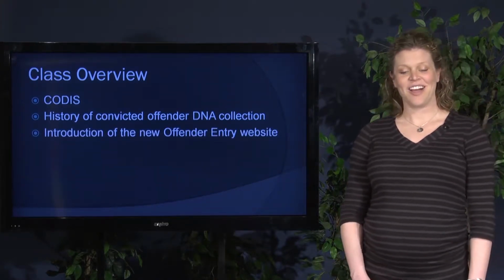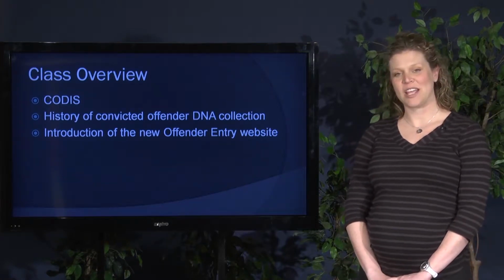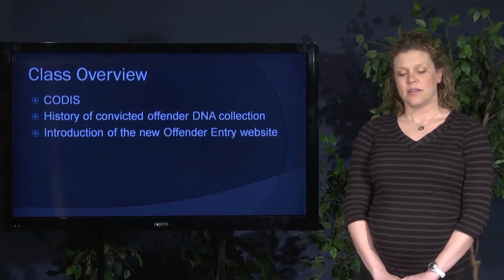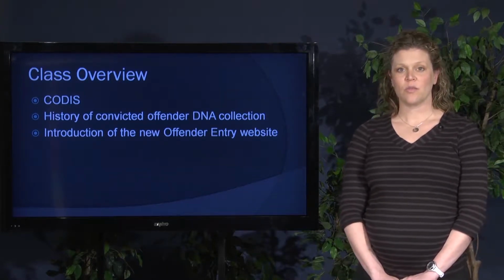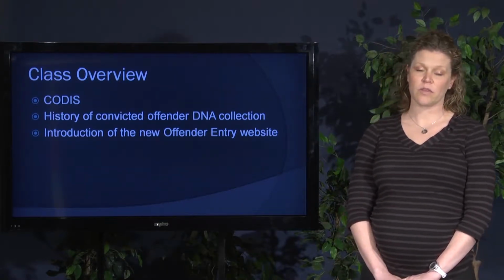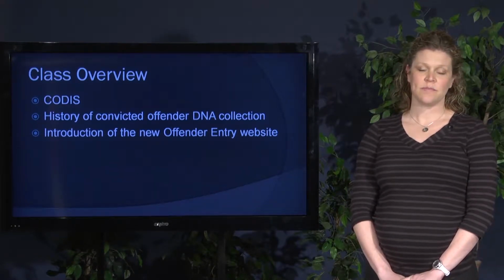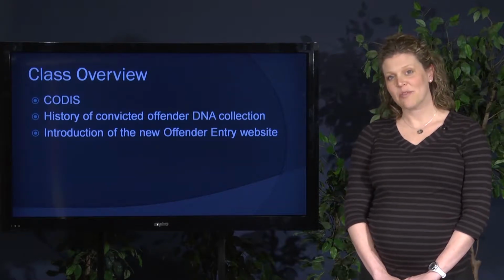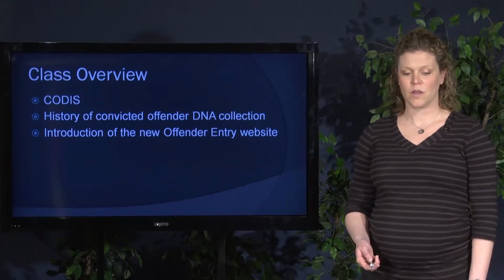Thirdly, I'm going to introduce the new offender website. We brought this online at the laboratory in response to the amount of samples we will be collecting going forward with the new law. It's very similar to the current evidence pre-log that's in place on the casework side. Some of you may be familiar with that.